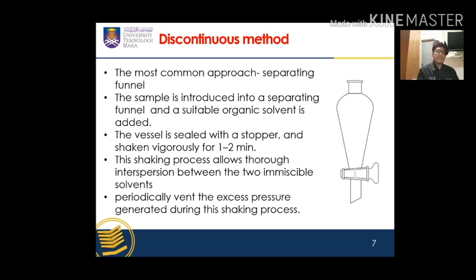This shaking process allows interspersion between the two immiscible solvents, thereby maximizing the contact between the two solvent phases, and hence assisting mass transfer and allowing efficient partitioning to occur. It is necessary during the process to periodically vent the excess pressure generated during the shaking process. Okay.